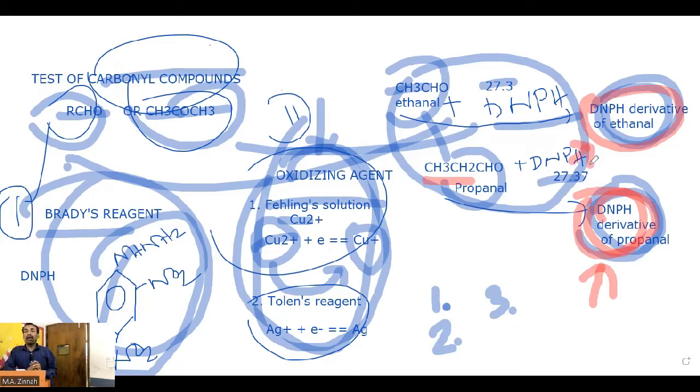For identifying them, we'll have the experimental data, experimental boiling melting point, and we'll match the experimental melting point with the data booklet. এখন তো গুগলে সার্চ দিলে সব বলে দেয়. গুগল is a great data booklet. দেখা দাও একটা জিনিসের মেল্টিং পয়েন্ট ডিটারমাইন করলে 63.19, গুগলে সার্চ দাও which substance boils at 63.19, কম্পাউন্ডে চলে আসবে. So this is how we do.